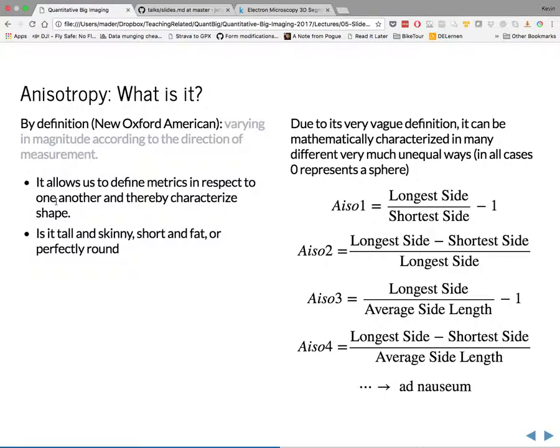If you have something that's isotropic, a lot of times with image acquisitions, you'll talk about isotropic pixel size or isotropic voxel size. And what that means is that it's the same in every direction. One of the things that makes computed tomography or synchrotron imaging very interesting is that you can have an isotropic voxel size, and that means that you get the same resolution in every direction.